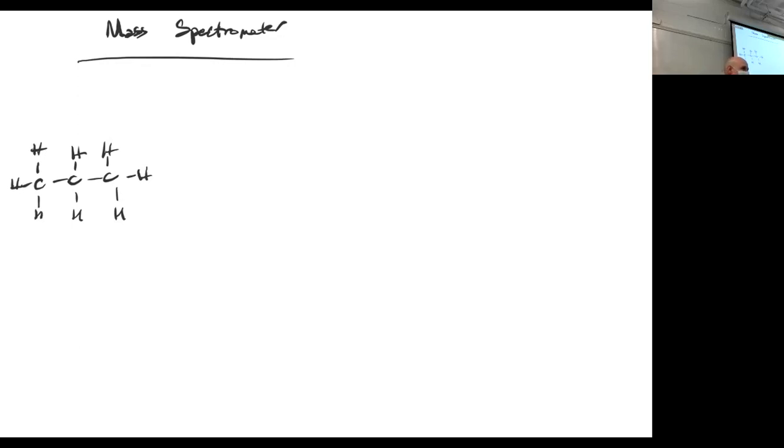So I'm going to spend about 5 to 10 minutes giving you a little bit of a background on how a mass spec works. There have been many developments, and this is going to be dramatically oversimplified and more historical than anything else. So don't assume that in the next 5 minutes you're going to know everything about the inner workings of a mass spec, but I want to give you just a general overview because I think understanding is worthwhile. But you don't really have to write any of this stuff down because our goal is going to be interpreting.